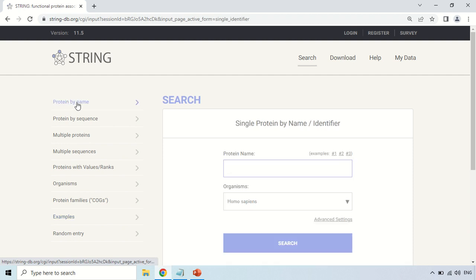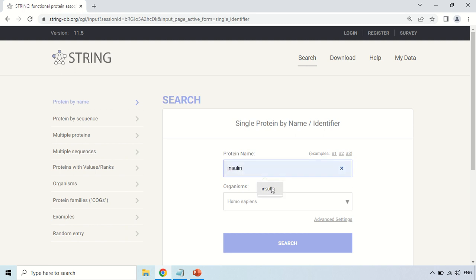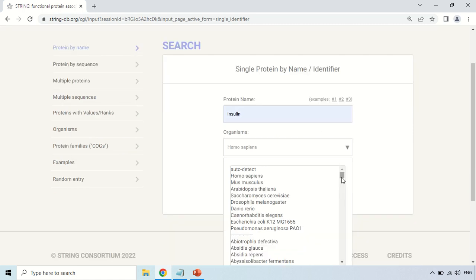I am clicking on protein by name and entering the name of the protein. For example, I am searching for insulin. As I search insulin, you can change the organism from here — it is already set to Homo sapiens. If you want to change it, you can click here and within a few seconds it will show you the list of all organisms available in the STRING database. It may take some time because it is a huge list.